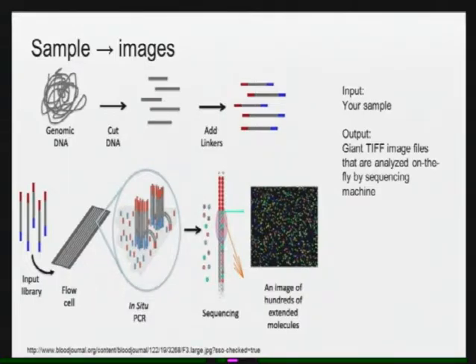Then we add linkers. Just by show of hands, who's familiar with the Illumina chemistry here that does this procedure? Is anyone familiar with this? Several people? Some people are? Yes? No? Okay.